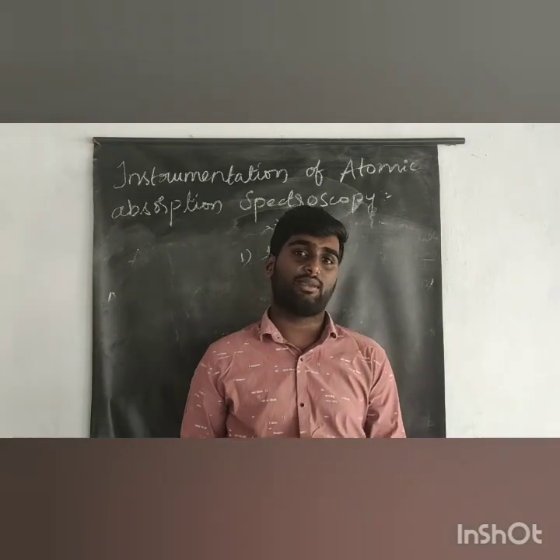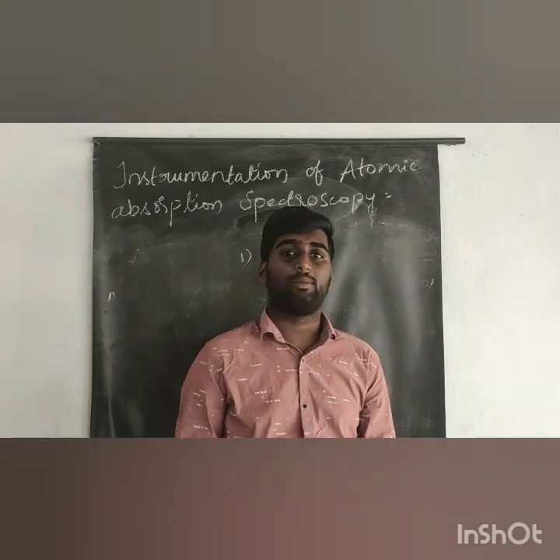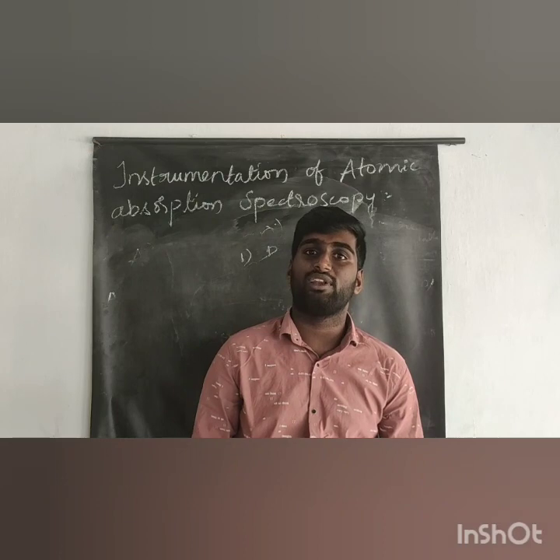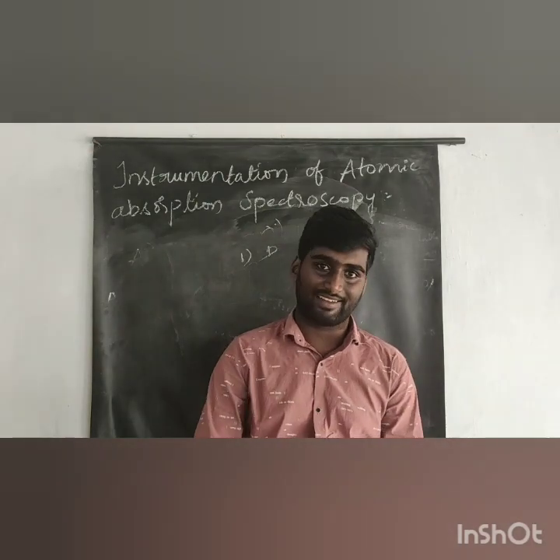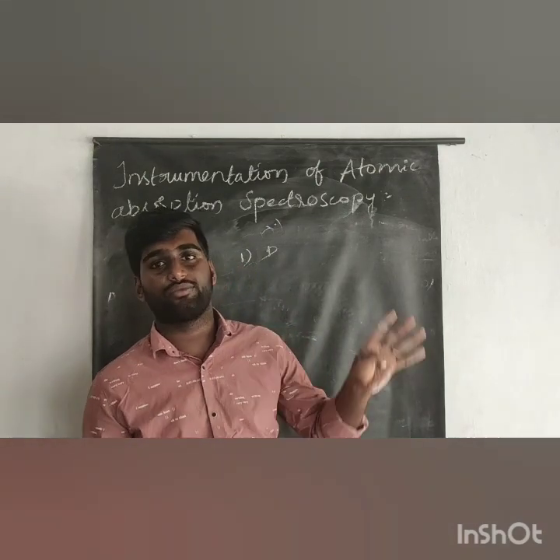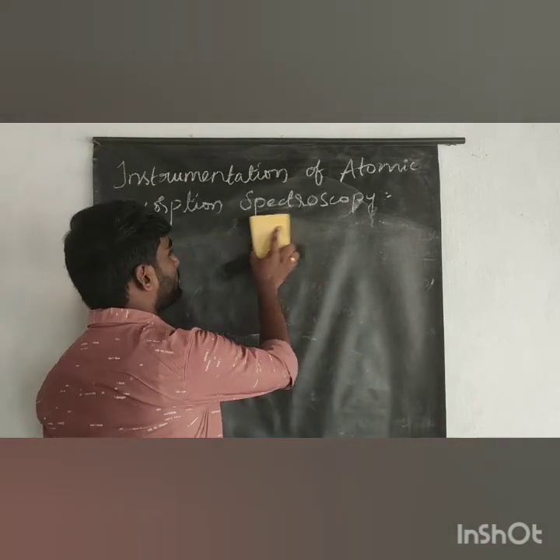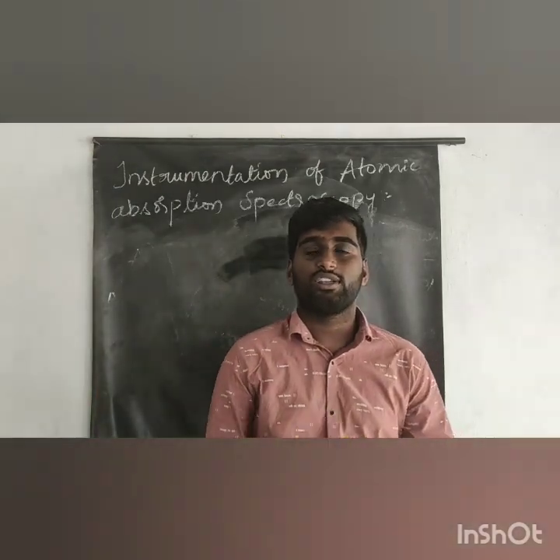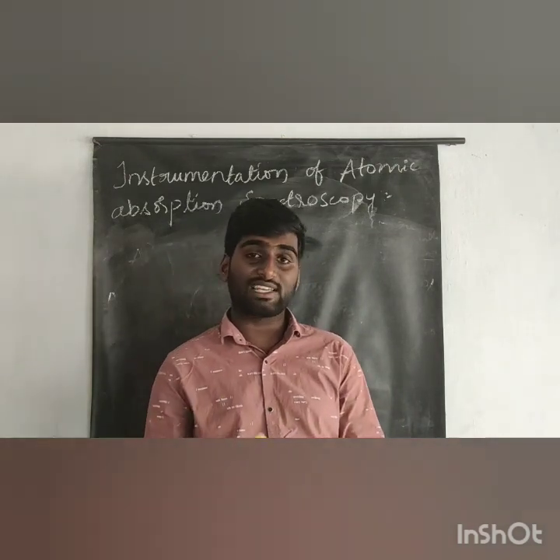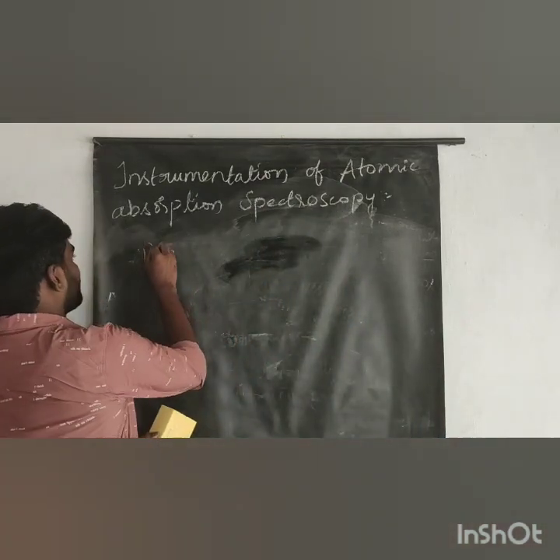What are the requirements of the flame? It will be in droplet size, and we have to choose which type of flame, what is the ratio of fuel and oxidant, and the tendency of the element which is to be determined or which is to be reacted in the atomizers. So these will be requirements of the flame, and it is a note-worthy thing. Okay, and after that I said about the two atomizers. What are the two atomizers? Total consumption flame and premix laminar flame. So first one, I want to say total consumption flame.